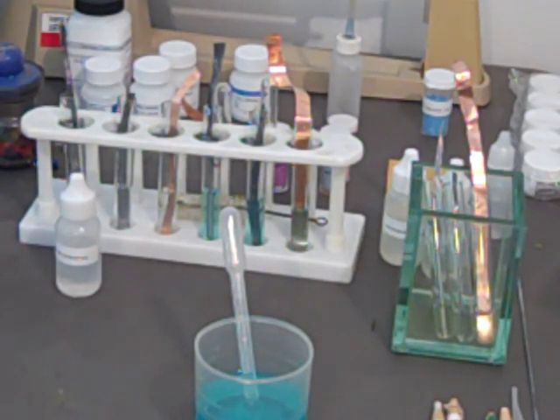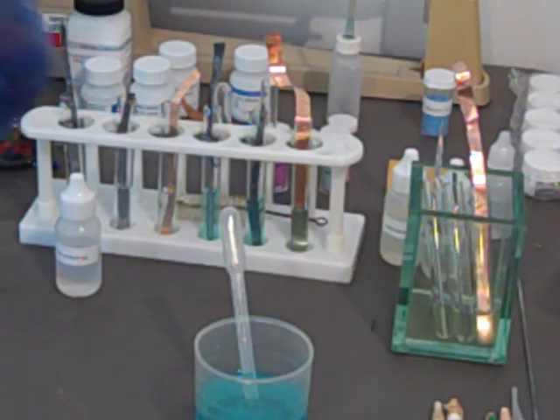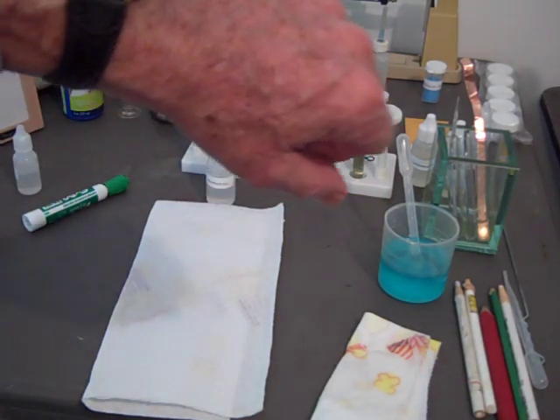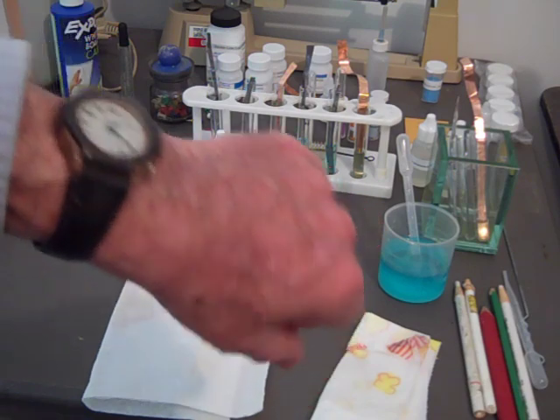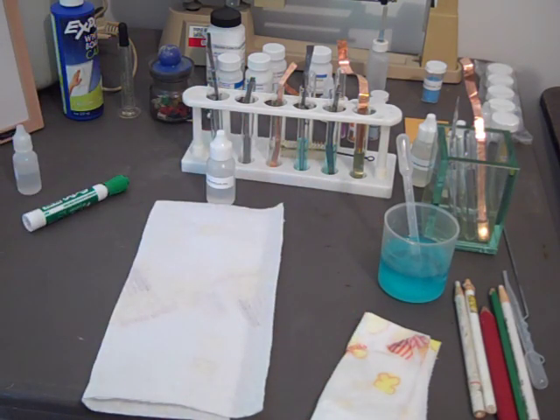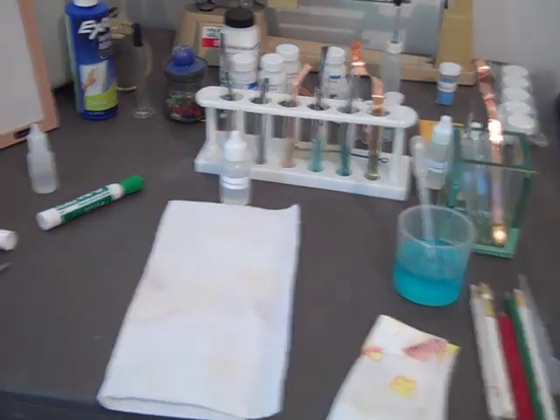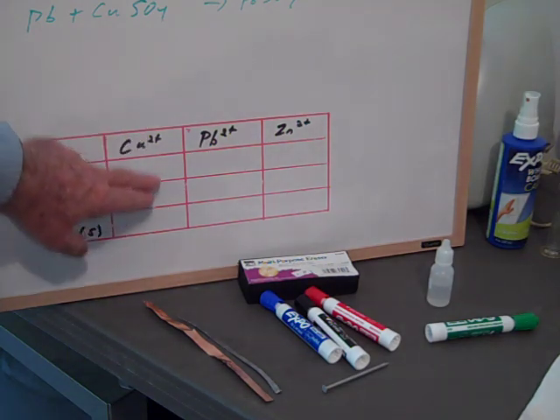We're supposed to wait now for 5 to 10 minutes. So we'll check the watch. It's 5 minutes past one. We'll give it a good 10 minutes. Okay, that's just about 10 minutes, you can see. And we're going to now inspect our materials and record our observations. Here we're going to do the copper sulfate first, which is the copper 2+ solution. We're going to fill those in now. First, we're going to look at it.